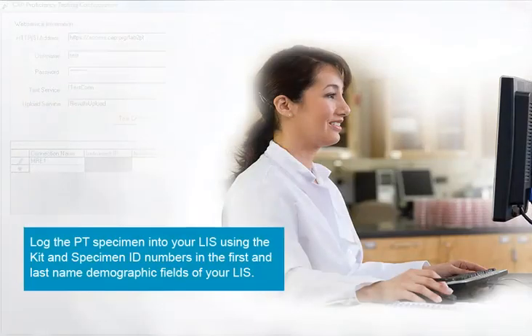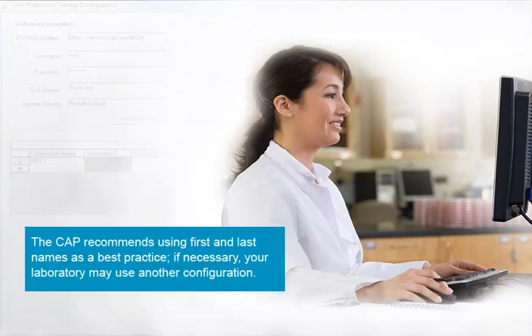Log the PT specimen into your LIS using the kit and specimen ID numbers in the first and last name demographic fields of your LIS. The CAP recommends using first and last names as a best practice. If necessary, your laboratory may use another configuration.